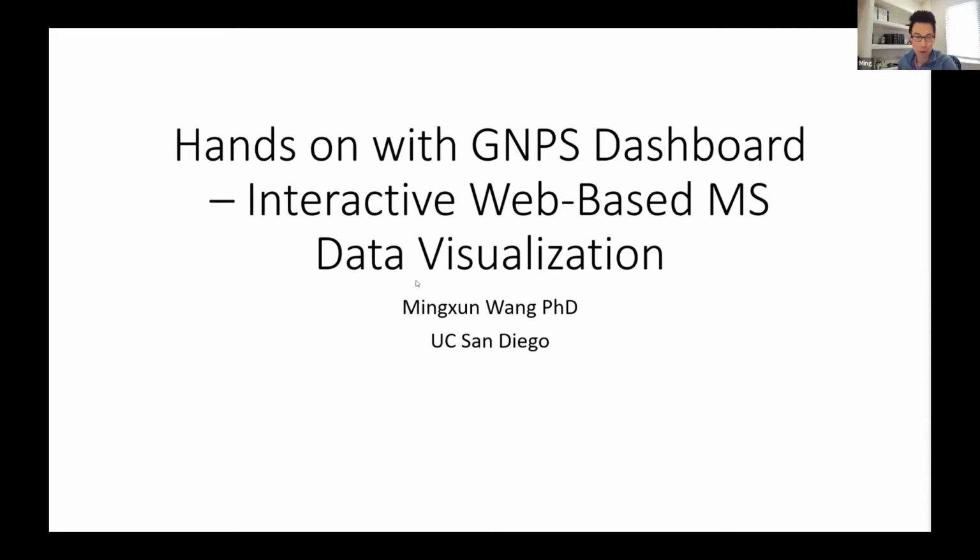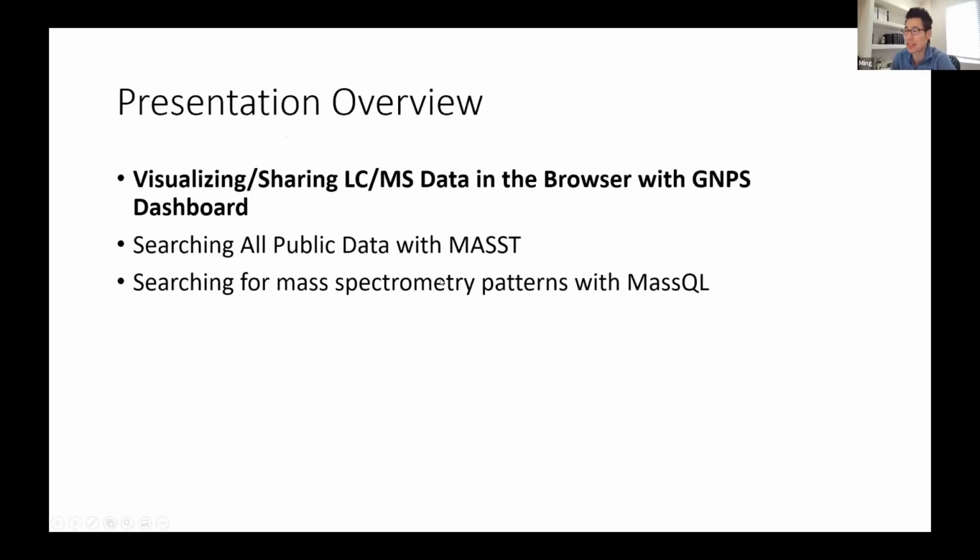I'll show you what our outline is. First, we're going to get started with the GNPS dashboard. Then I'll do a little bit of explanation, but it's mostly a little voice exposition and then more hands-on. Feel free during all of this to ask questions in the chat. If you're behind a little bit, Danny, did you send everybody the presentation file? No, but I can provide the URLs in the chat. Okay, let's do that. It's good to do the catch-up links, and then we'll keep going.